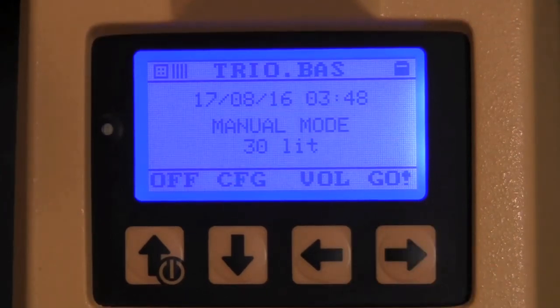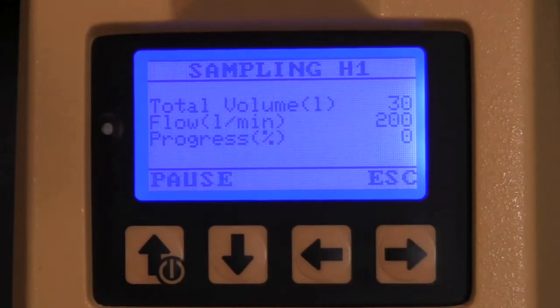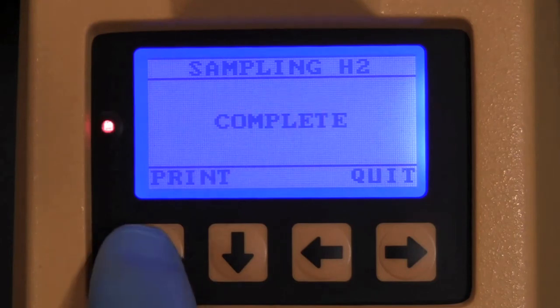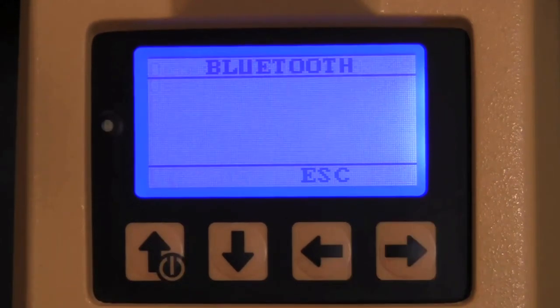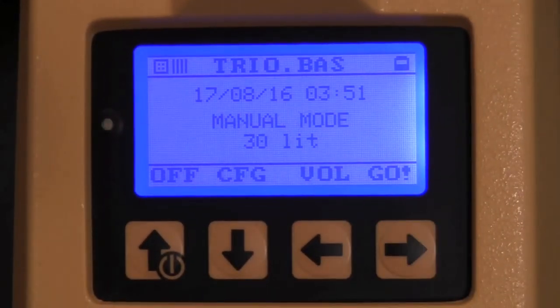The display now goes back to the initial screen and you are ready to sample. Press Go to begin sampling. At the end of the sampling cycle, the display will read complete. Press Print to print the data via your Bluetooth download, or Quit to exit and have your data stored.